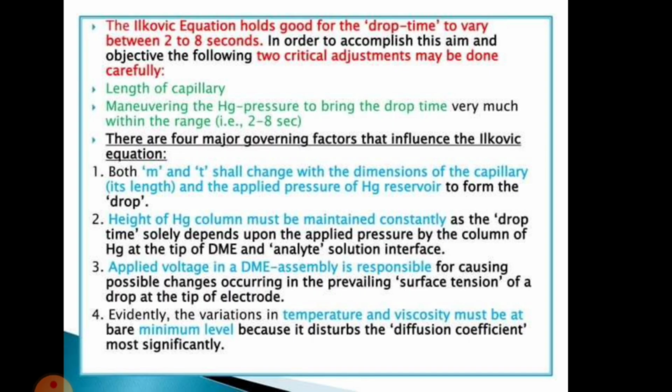Second, the height of the Hg column must be maintained constant, as the drop time depends upon the applied pressure by the column of Hg at the tip of the DME and analyte solution interface.